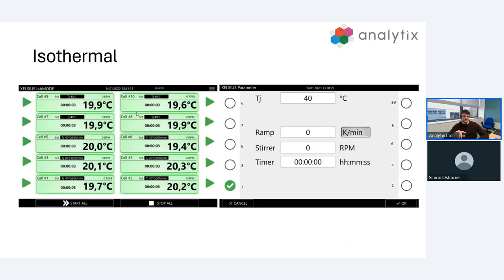We can start or stop all cells at once, or we can use the green triangles on the side to start and pause each individual cell. On the right you see our isothermal parameter setter. Here we're simply inputting the temperature of the jacket, the ramp speed, stirring, and time. We can then use the numbers on the left and right side of the screen to apply this method to multiple cells, and then it's all a case of pressing OK and starting your method.